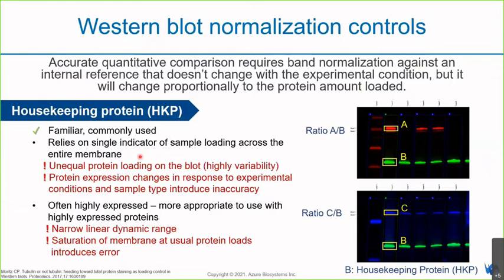However, there are multiple steps that lie between the protein determination, for example, Bradford assays, and the final visualization of the blotted proteins in your Western blotting protocol. There are at least four of them that can prevent equal loading on the blot.